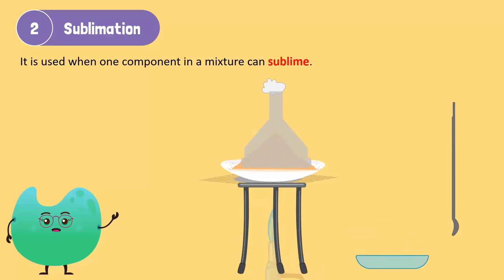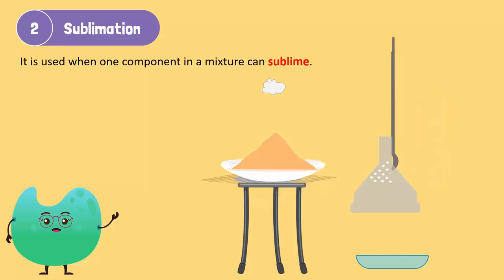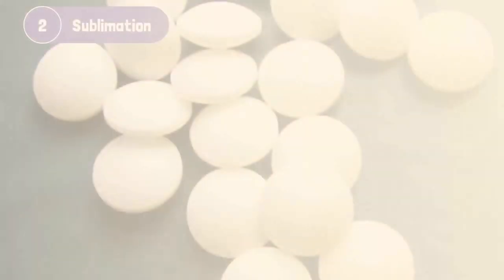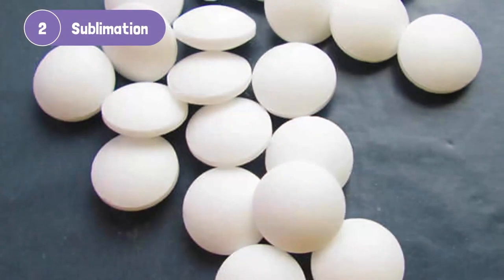Stop heating when the white fumes stop rising and allow the funnel to cool. After cooling, remove the funnel from the china dish and, using a spatula, transfer the solid naphthalene sticking on the walls of the funnel into a watch glass. The sand will be left in the china dish. These naphthalene balls are more commonly known as mothballs. They are used to prevent the presence of insects.